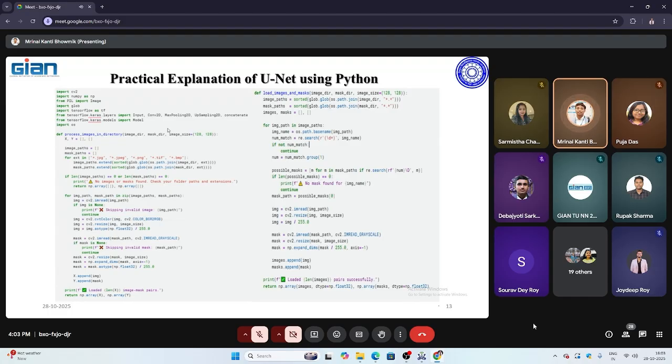Because binary masks, as you have seen in the earlier lecture, have been developed and saved in two formats, whether PNG or .bmp files. So the ground truth and the images have to be considered in all the extensions available: .jpg, .png, .tif, .bmp have been considered, and then it is sorted.